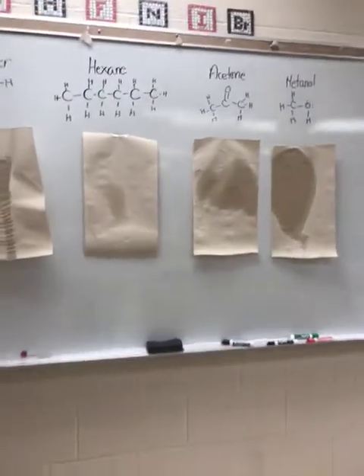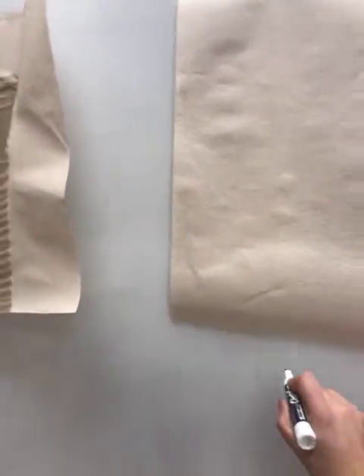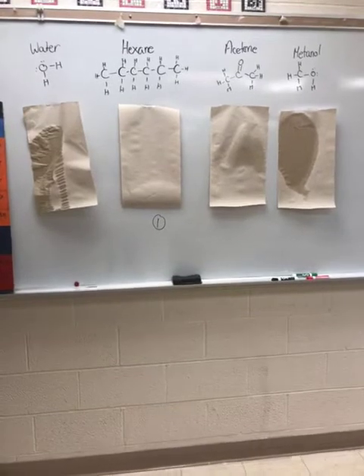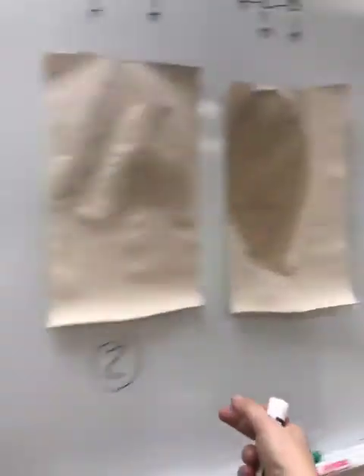Oh, look, the hexane is almost gone here. So it looks like hexane is number 1. I'm going to say 1. And let's look back. Which one can you tell is going second? It looks like acetone is going second. And I'm going to help out my water and my methanol a little bit, get them to go a little bit faster.